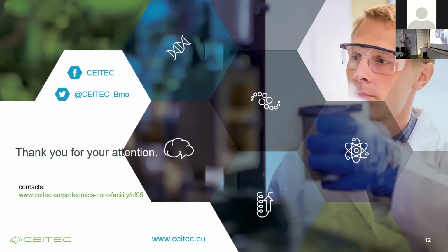So now we will build another more sensitive instrument, and what was not possible last year, maybe it will be possible next year, because the dynamics in instrument development in mass spec for proteomics is really high.